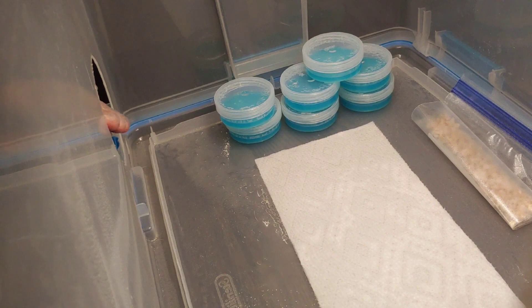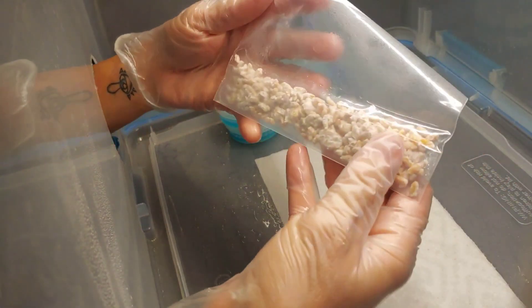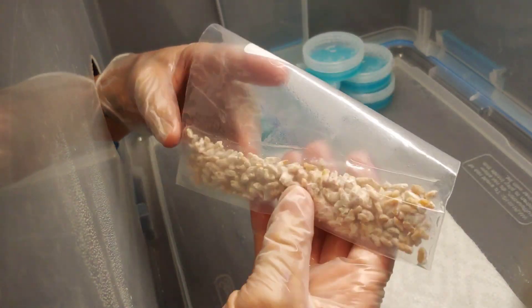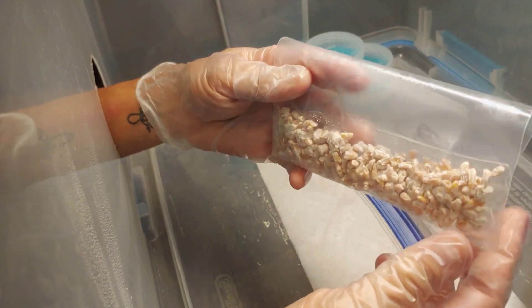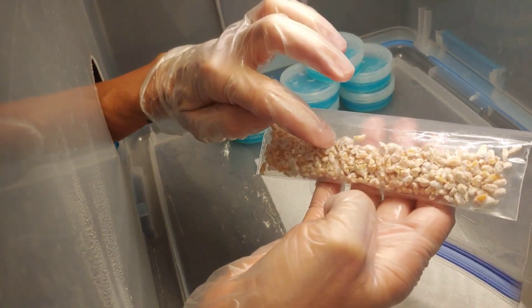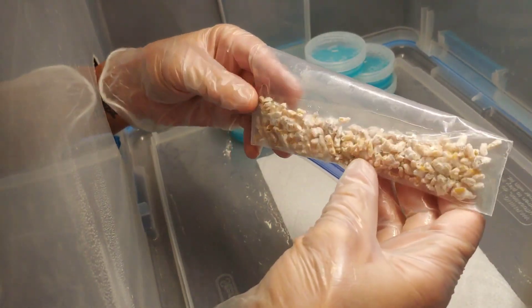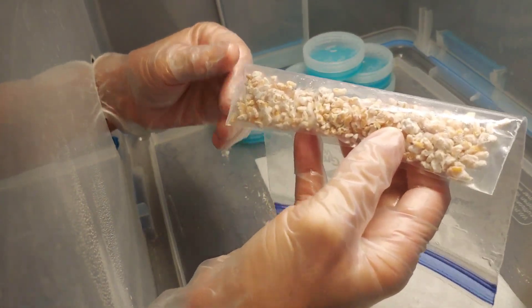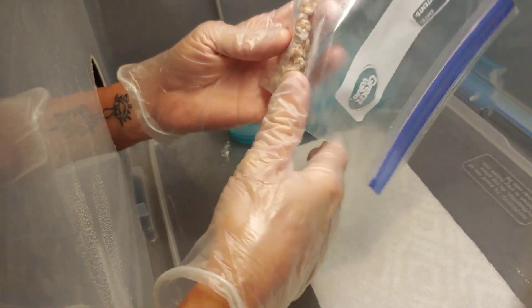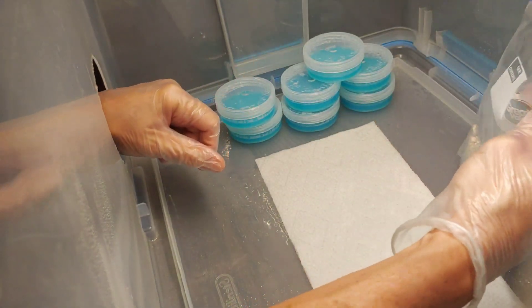What we're going to do today is take some saved, colonized rice and put one grain of rice on agar — just to demonstrate how we can multiply from just one grain of rice and keep going, which is awesome. All right, let's do this.